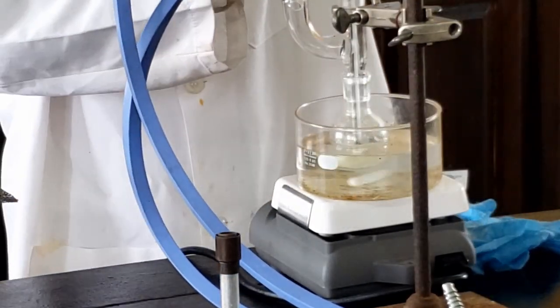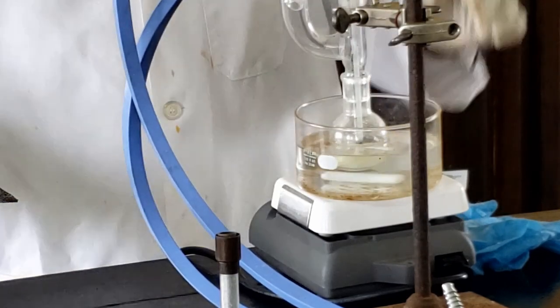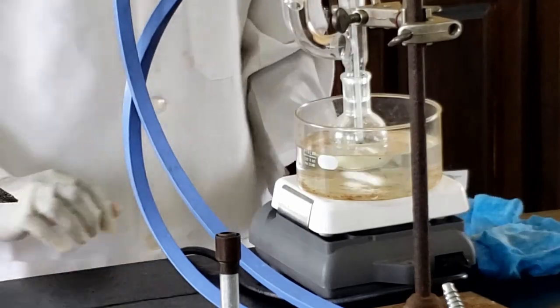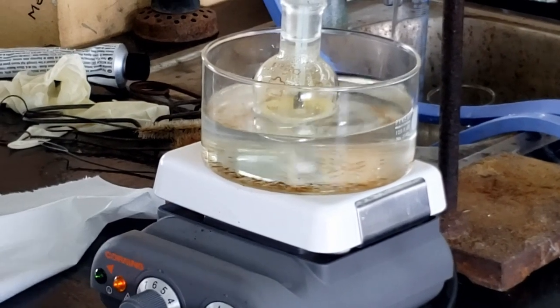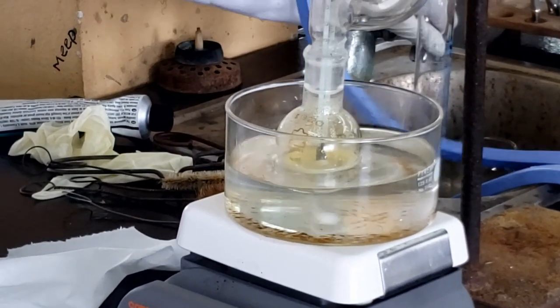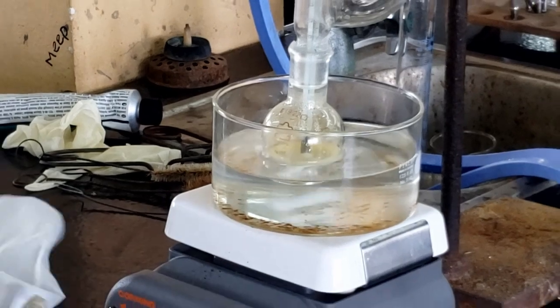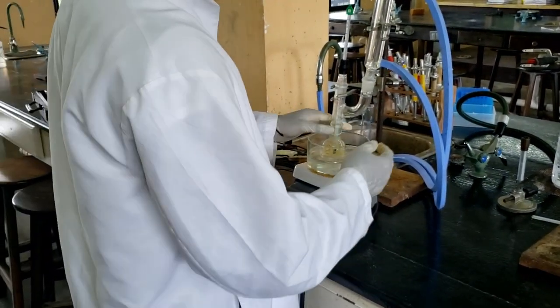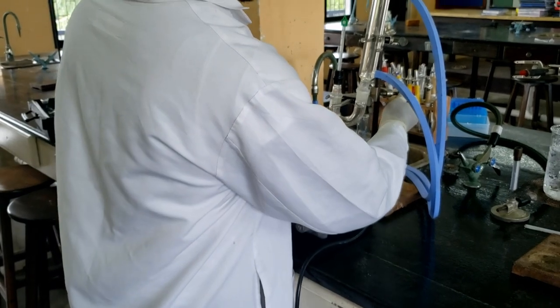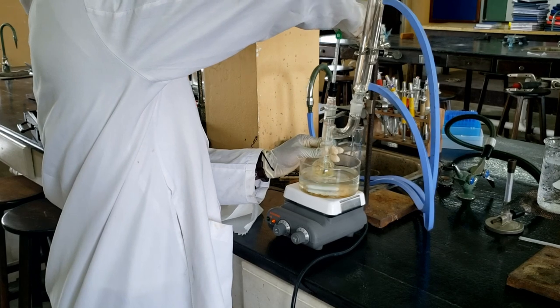I'm just going to monitor this temperature and I'll come back when we've warmed this for 15 minutes. Okay, so we can turn off the water. We've maintained this solution between 50 and 60 degrees Celsius for about 15 minutes now. So I'll just raise the apparatus.